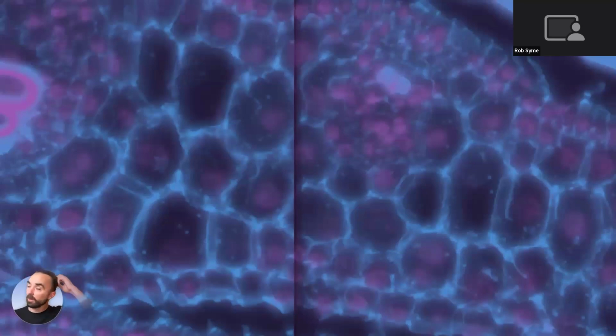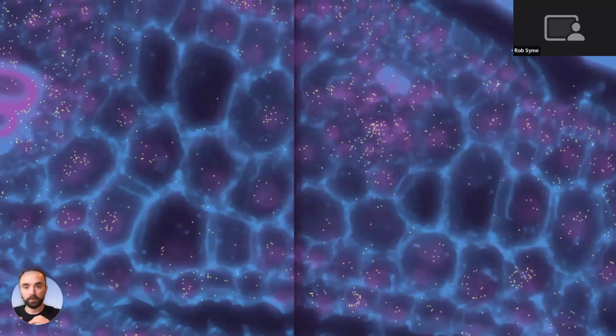So, a very, very quick background to the paper. We have this small section of maize leaf tissue, and we have stained the cellulose walls, shown here in blue, and the DAPI stained the nuclei, shown in magenta. And this Molecular Cartography system is an optical platform that allows one to spatially resolve single transcripts, which we can overlay on these two stains. Each of these yellow pixels that you can see on the screen now represents a single RNA transcript for which we have an XYZ position and also the transcript ID.